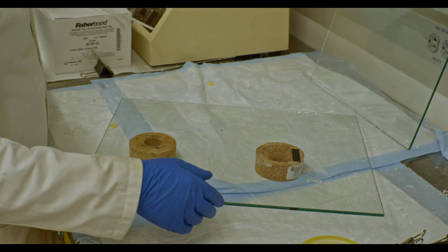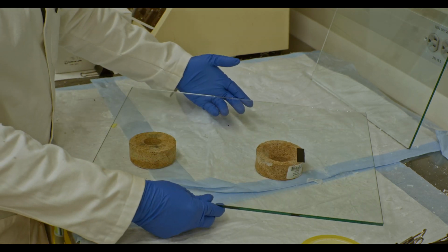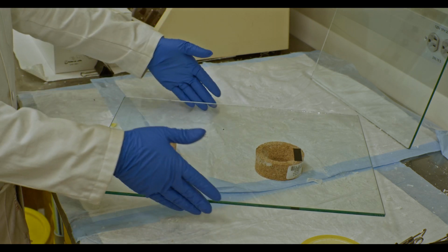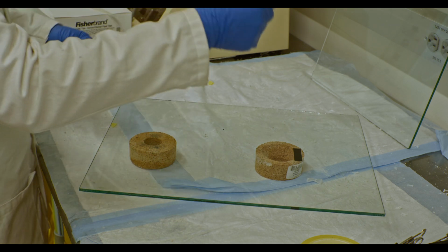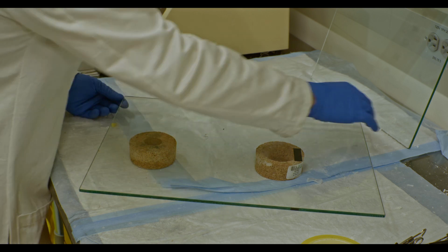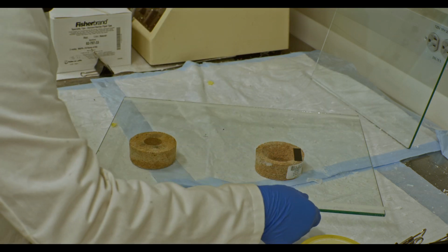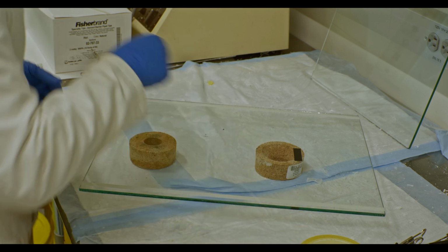The gel piece that I use is always the longer piece that doesn't have that U cut out here at the top. As you can see, there's this little strip that's actually a temperature strip. I always make sure that's facing down. I use a pair of round bottom flask holders in order to nicely even out the glass plate. So what you have to do is place these spacers. The long ones go on the sides, and then there's a shorter one that goes at the bottom.